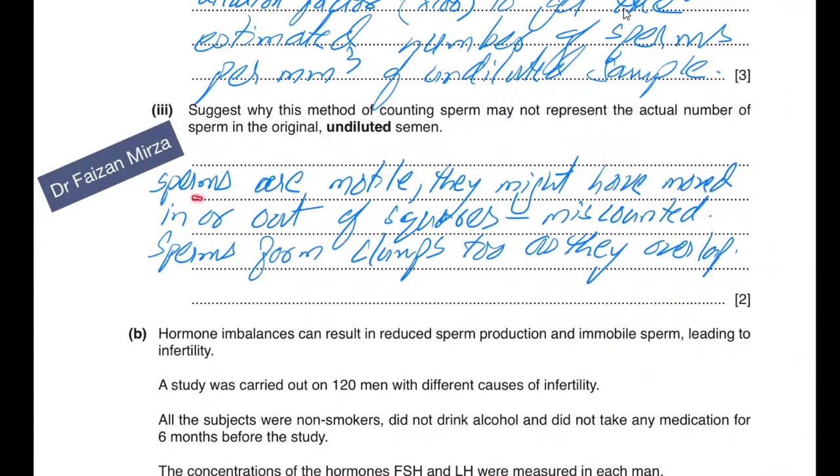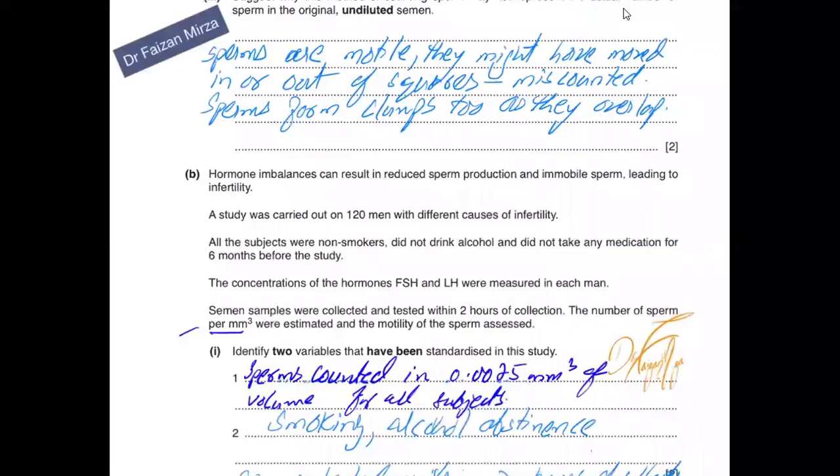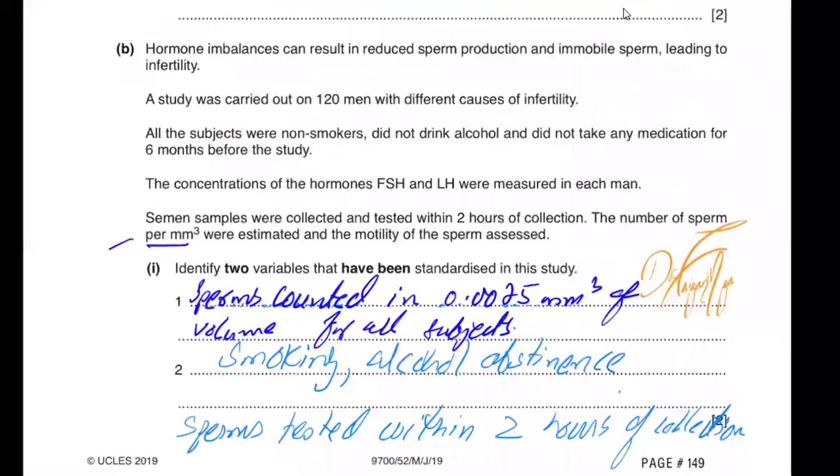Suggest why this method of counting sperm may not represent the actual number in the original undiluted sample. The sperm are motile and might have moved in or out of the squares, causing miscounting. They also form clumps, may overlap, and this may result in a wrong count.